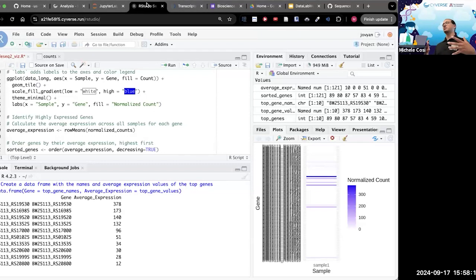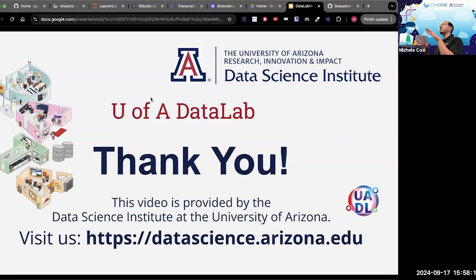DESeq2 and working with DESeq2 is going to come back in 3 weeks from today. Next week and the week after, we are going to be talking about Nextflow and Snakemake, because you might have seen a lot of these pipelines have a ton of different tools. Some scientists decided we're going to put things together and make things run faster and smarter using pipeline management tools. So that's what I'm going to cover the next couple of weeks, Snakemake and Nextflow. And then in 3 weeks, we come back with a proper DESeq2 deep dive with, again, real world data. I think we're going to be using mouse instead of E. coli, just because it helps with the wow effect, maybe.